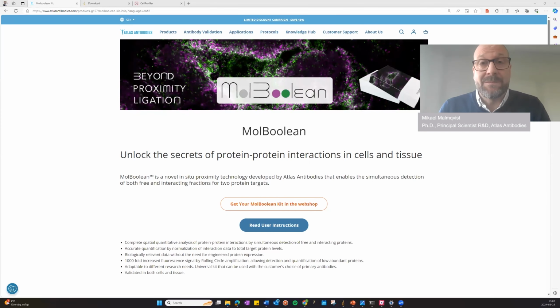Hi everyone, my name is Mikael Malmqvist and I'm a principal scientist in the Research and Development Department here at Atlas Antibodies. Today I will be giving you a tutorial in how to perform the image processing and image analysis steps that are needed to analyze the MolBoolean results.